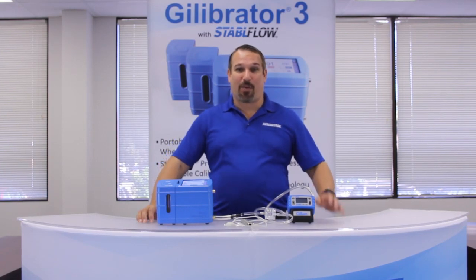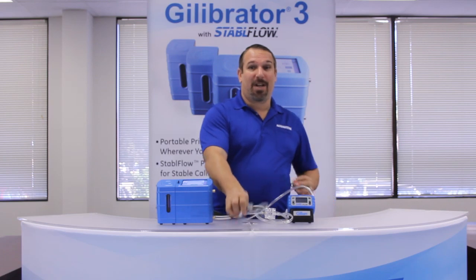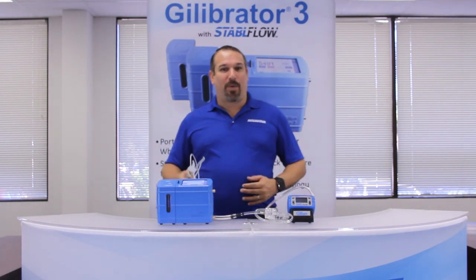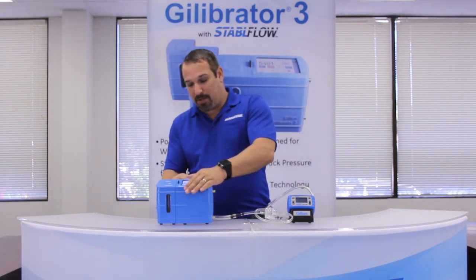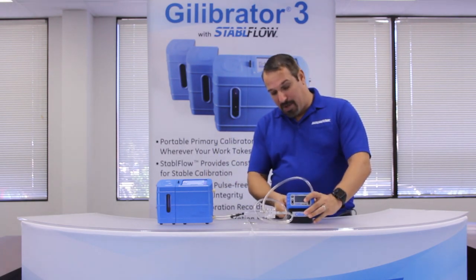Chapter 6: SmartCal with the GillAirPlus Pump. If we were to use the SmartCal cable to self-adjust the GillAirPlus Pump, the procedure would be the same, but we would need to connect the communication cable between the calibrator and the docking base for the GillAirPlus Pump.